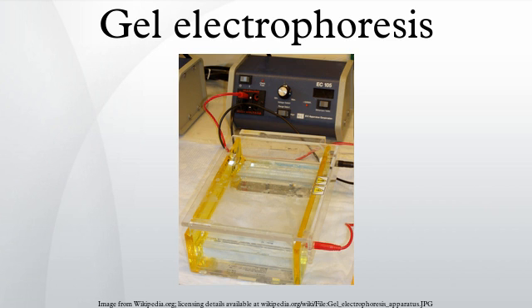History: 1930s, first reports of the use of sucrose for gel electrophoresis. 1955, introduction of starch gels, with mediocre separation. 1959, introduction of acrylamide gels, disc electrophoresis, with accurate control of parameters such as pore size and stability. 1966, agar gels. 1969, introduction of denaturing agents, especially SDS, for separation of protein subunits. 1970, Laemmli separated 28 components of T4 phage using a stacking gel and SDS. 1972, agarose gels with ethidium bromide stain. 1975, two-dimensional gels: isoelectric focusing then SDS gel electrophoresis. 1977, sequencing gels. 1983, pulsed field gel electrophoresis enables separation of large DNA molecules.